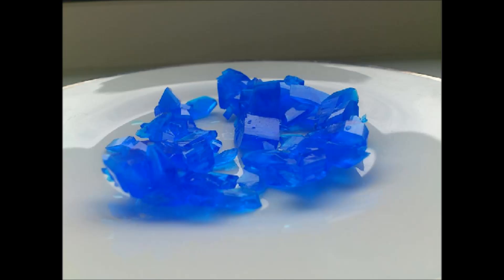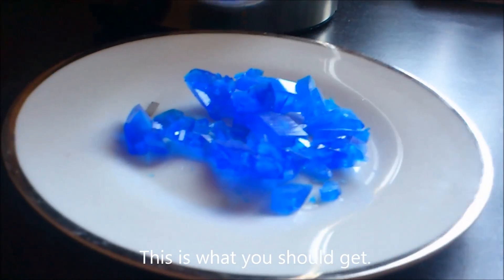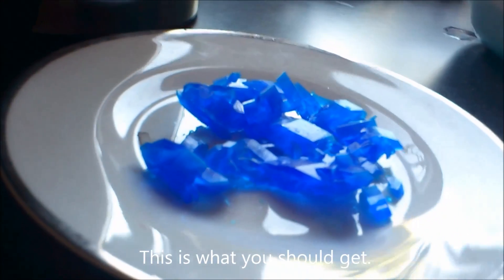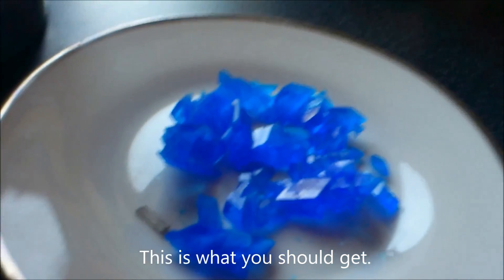Here you can see my copper sulfate crystals, which I've been growing for about two weeks. I think they are nice — they look good. They do get dusty, but you can clean them easily.